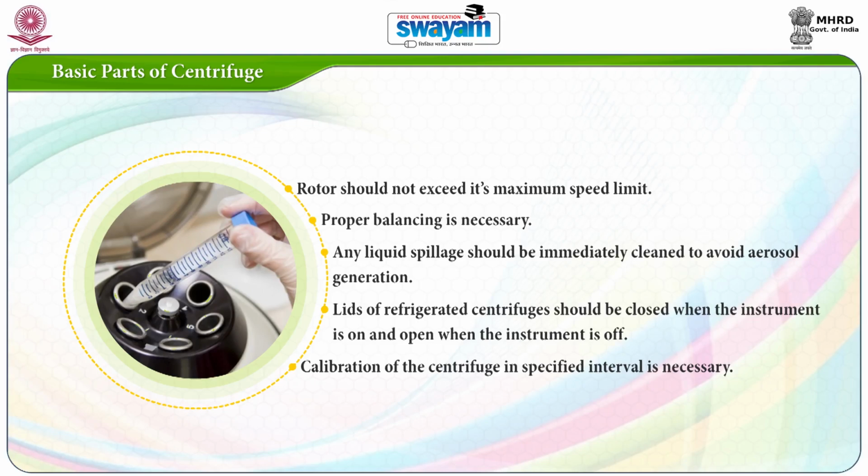Because it's a refrigerated system. If you keep it closed, there will be water condensation. The water will form. So just keep it open so the water will evaporate. Clear? So for all refrigerated centrifuges, after usage, properly clean it, then leave it open so that it can dry.